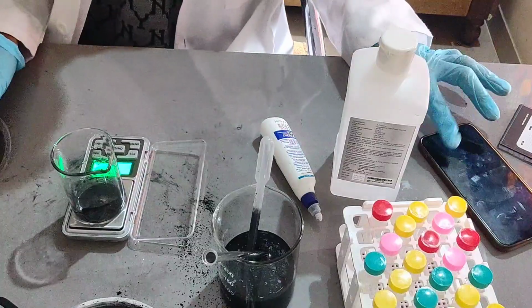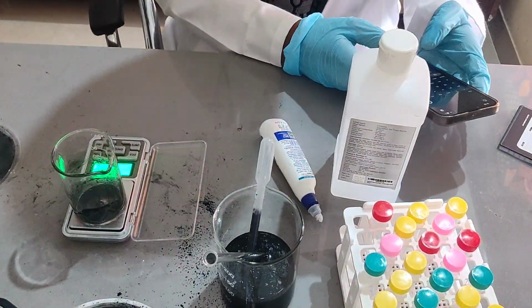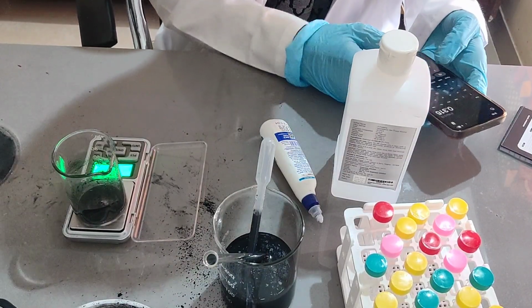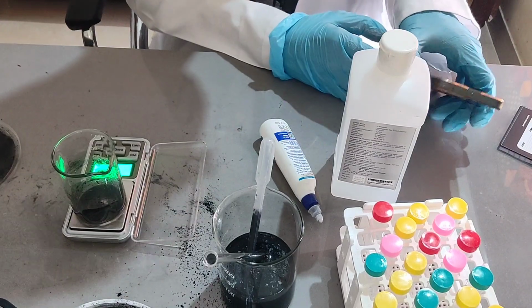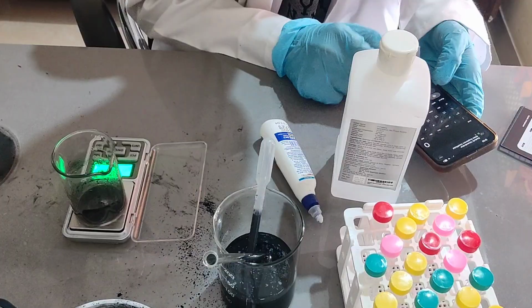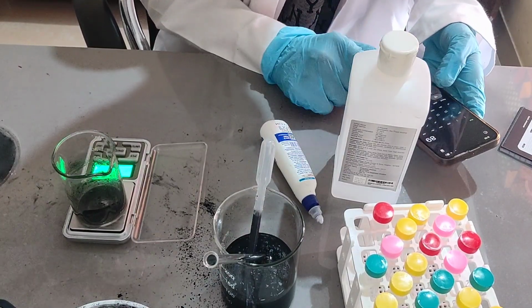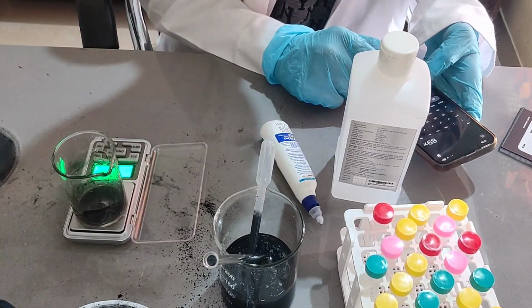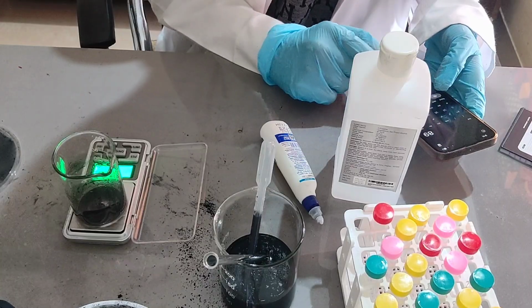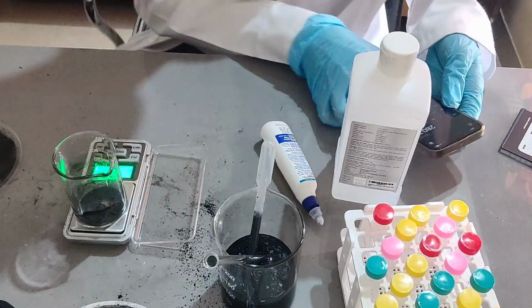The graphite now, and now we are going to do the 10% one. 0.10 into 5. It's going to be 3 grams, 0.3, and then it will be 9. 2.8.